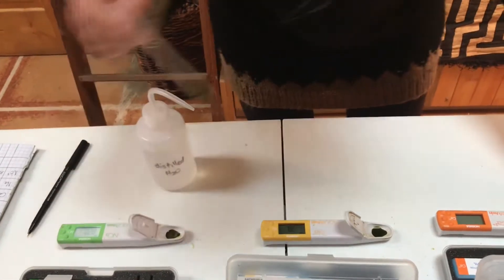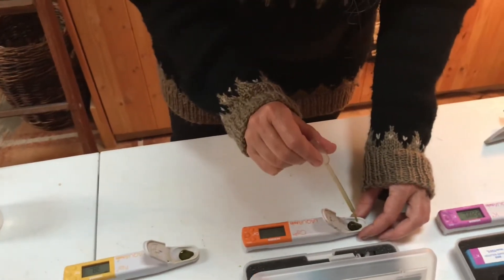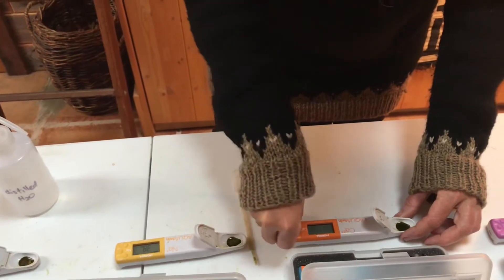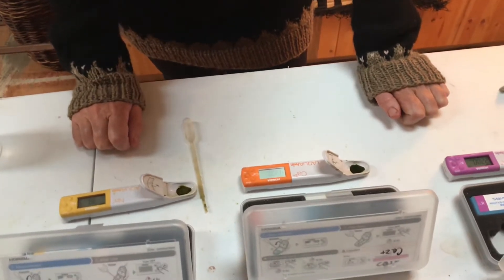Then we move the sap to the calcium meter. Be really careful when using the pipette not to touch the electrodes because that will really damage them. So we wait for the smiling face to read the calcium.